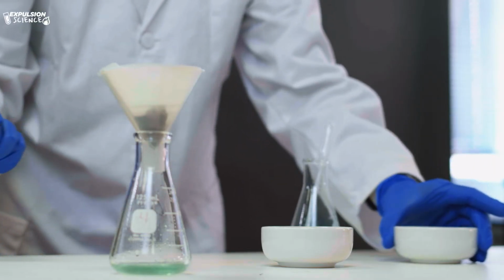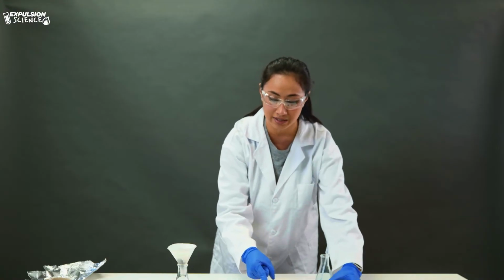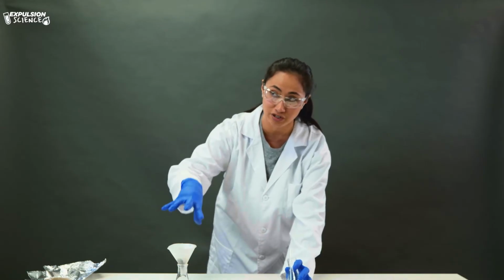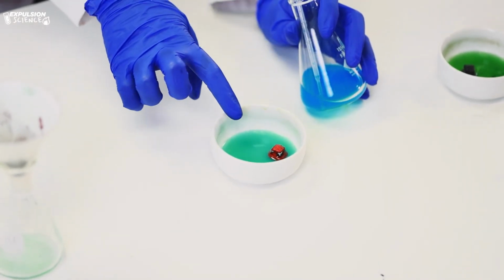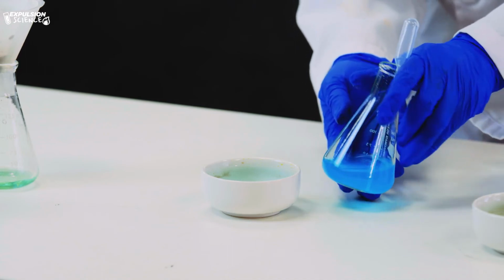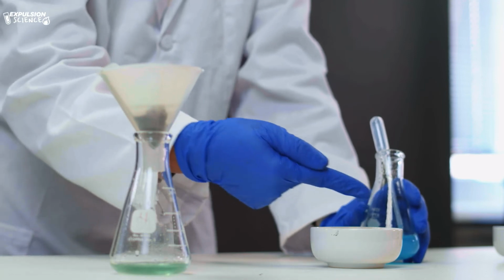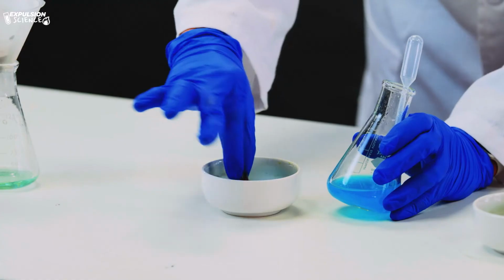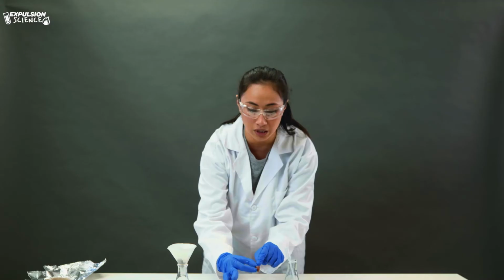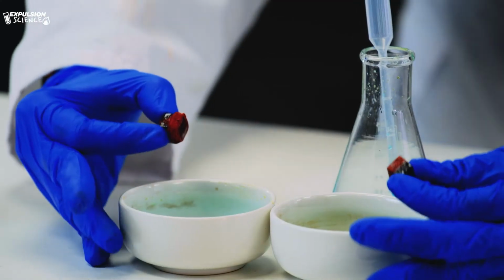Now let's take a look at this mixture right here. So this mixture has the aluminum block and the copper 2 chloride. The exact same reaction that's happening here. It's just this one we're using an aluminum block. We started with a blue looking substance, and now we've got this blue, dark gray, cloudy liquid that has formed. If I pick up what was the aluminum block, you'll see that you've got more copper around this block in comparison to tin. Let's take a look.